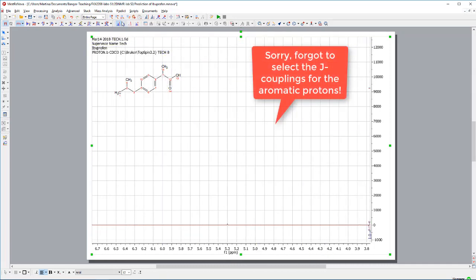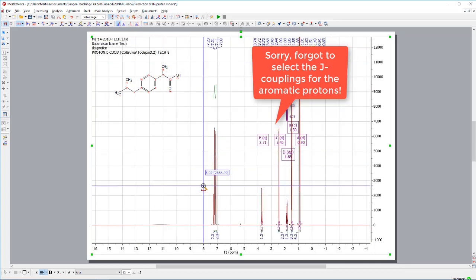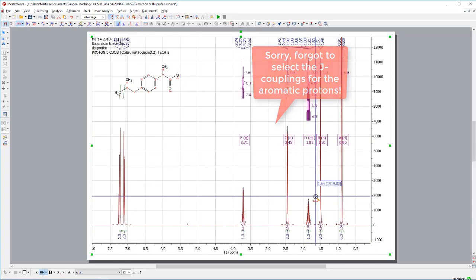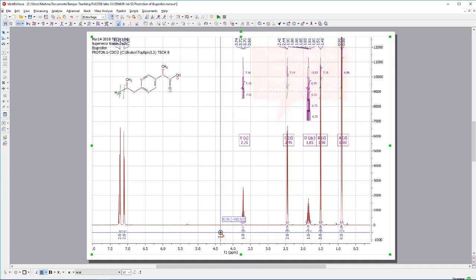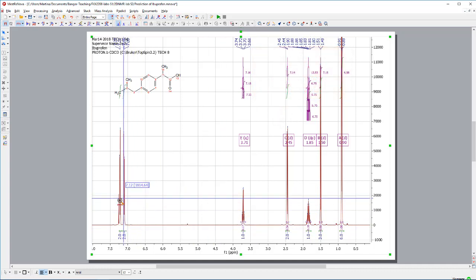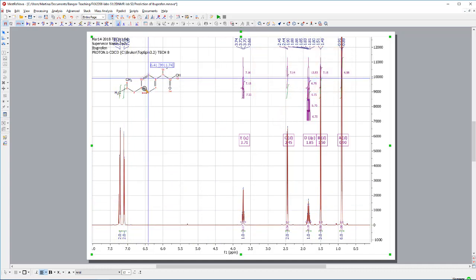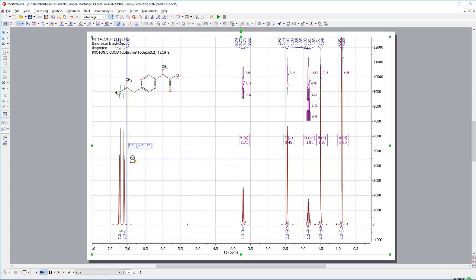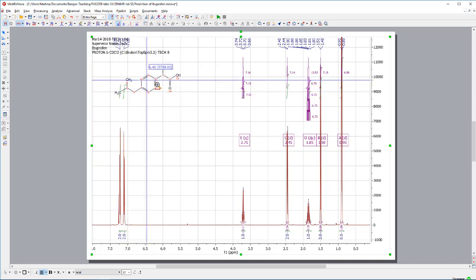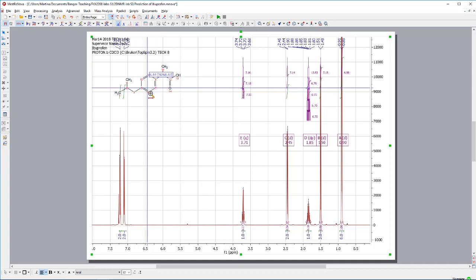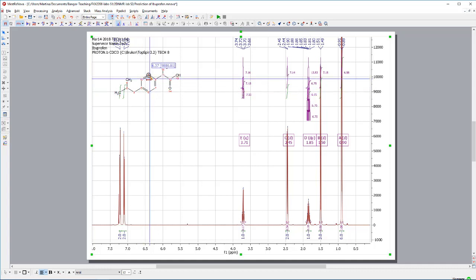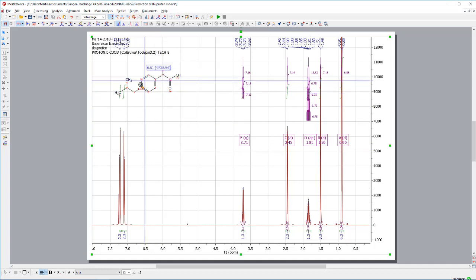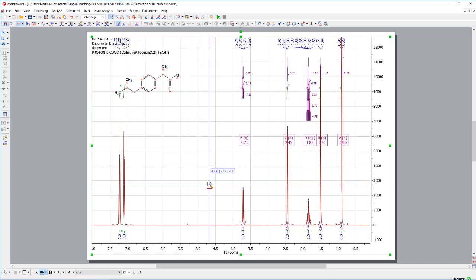If I go back and have a look at the full spectrum. Zoom again. What can I gather from here? I get my four protons from the aromatic system. I can't at the moment tell which set belongs to which side here. So, whether it's ten and six or nine and seven. I can't see this. The quaternary obviously are not turning up.